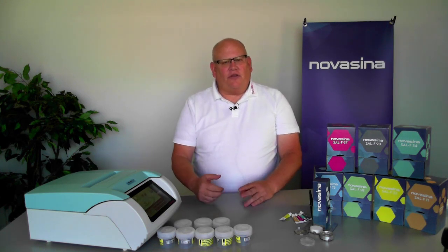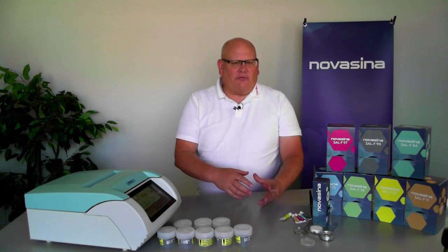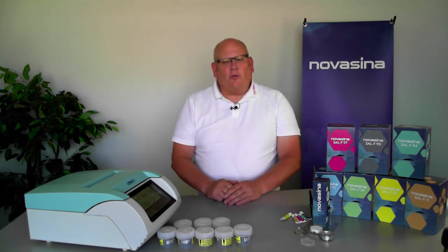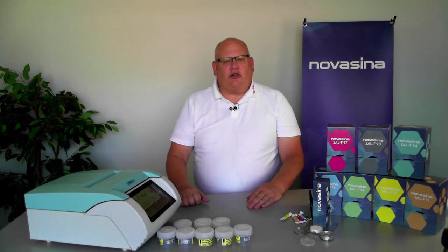In summary, that's how you do a calibration verification on the LabMaster NEO water activity instrument using both the SAL-T standards — the reusable ones — and the SAL-F standards — the ones that are not reusable but run very quickly. We hope this video will help you in your calibration and verification process on your instrument. Thank you.